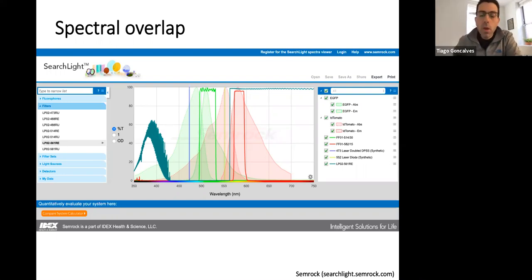And this can be a problem. Why can this be a problem? Well, because what happens when you have a lot more of one fluorophore than the other? Say you have a fluorophore that is much, much brighter, and you even have more of that, what happens is that you have bleed through into the other channel. So this is something to keep in mind. So you always need to check whether you're seeing bleed through. For example, one clear indication is if you start seeing a lot of features that are the same in the red image and the green image, that's usually a cause for alarm. And you run into this all the time. For example, we have a situation in the lab where we have a very faint staining for a molecule called DCX, and then GFAP, the astrocytic marker.